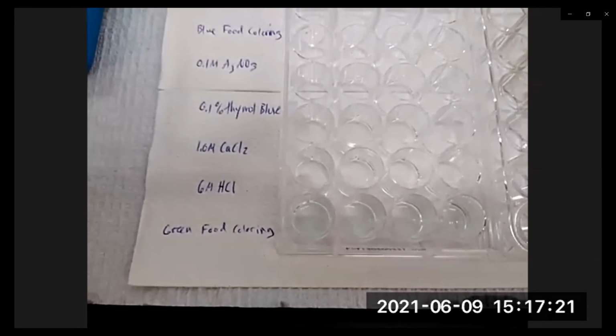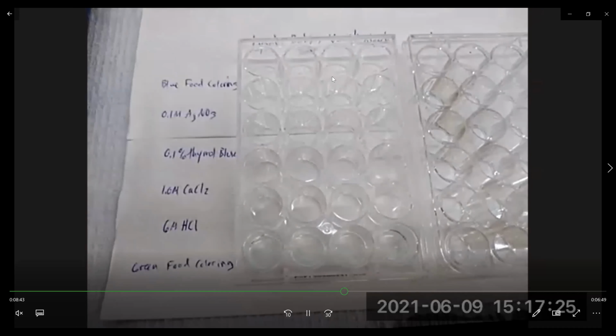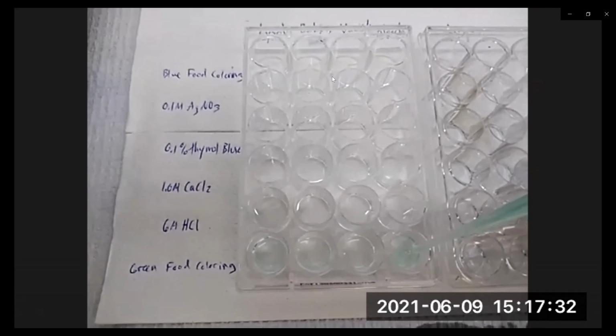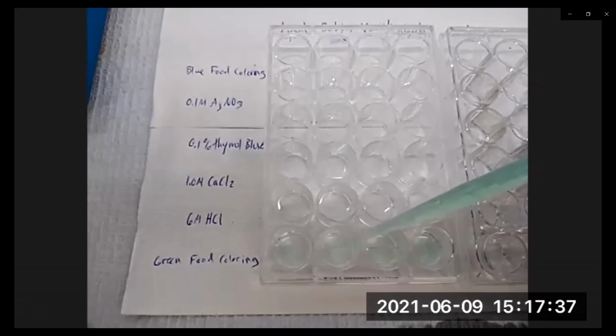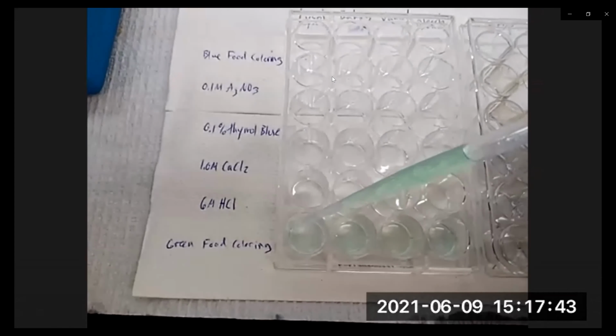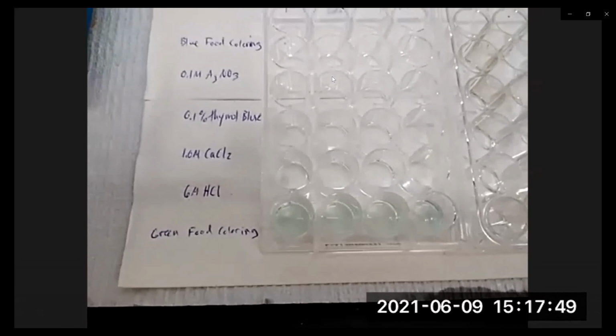So right now it looks like no reaction has occurred so far. We're going to add a few more just to check. And you always add a few more drops of your reagent to see if any reaction occurs.